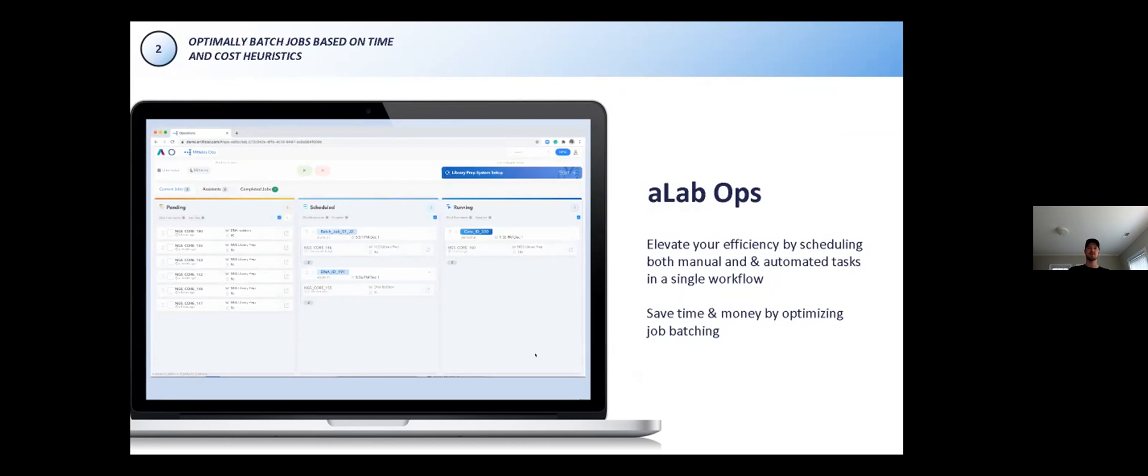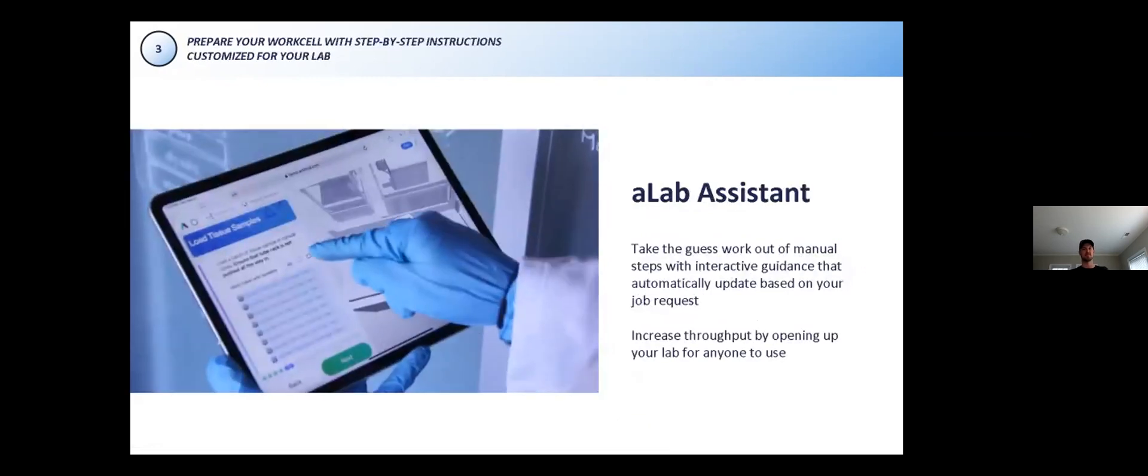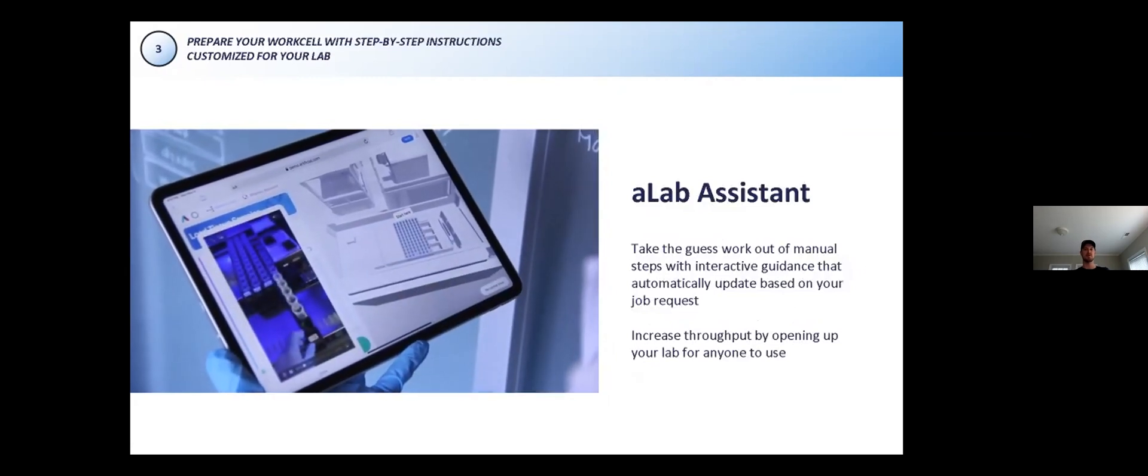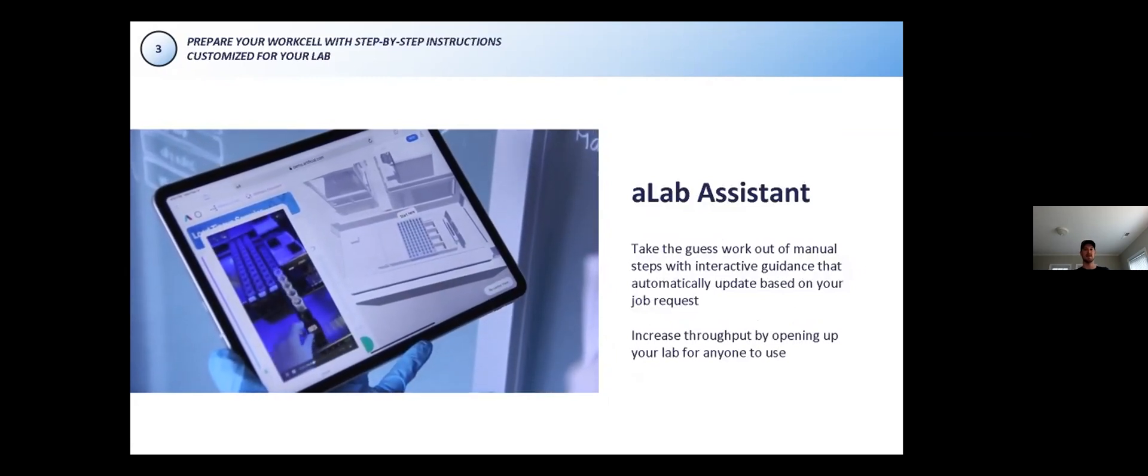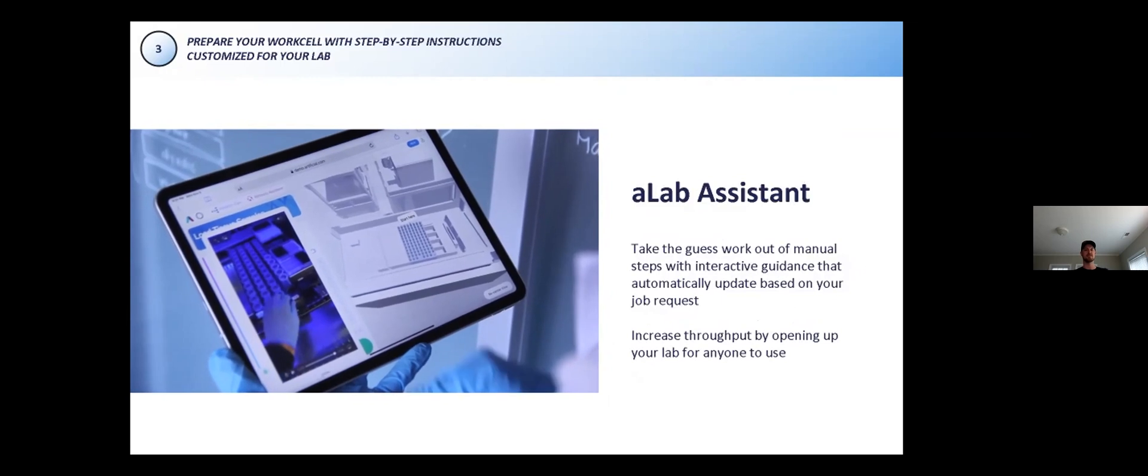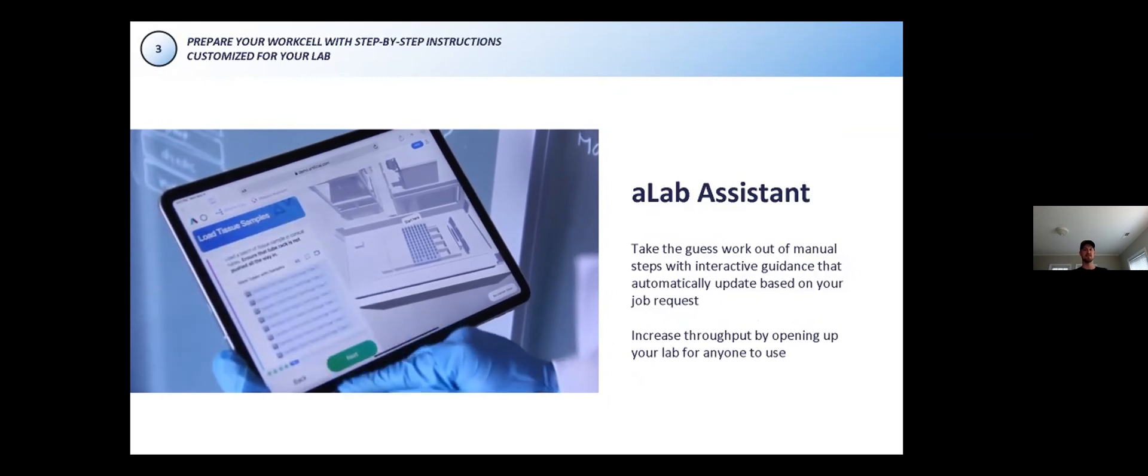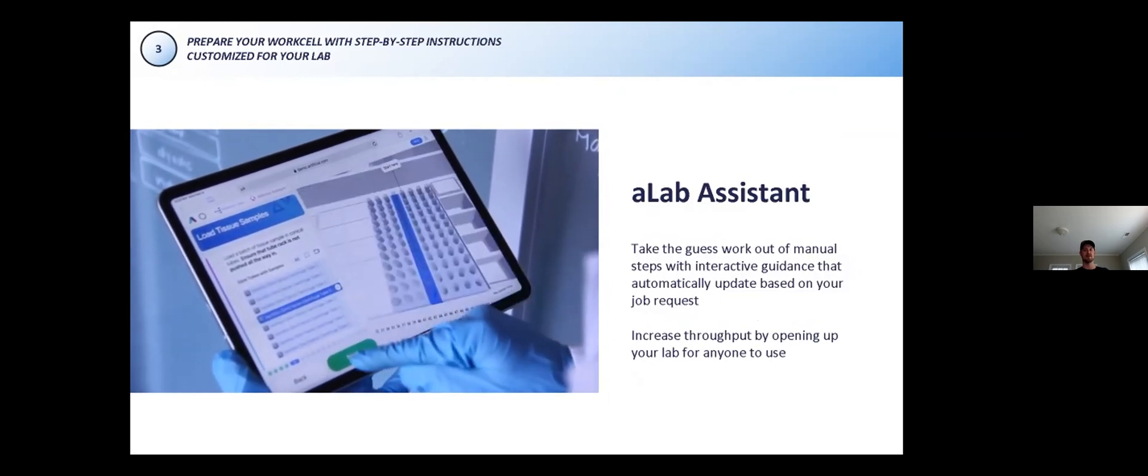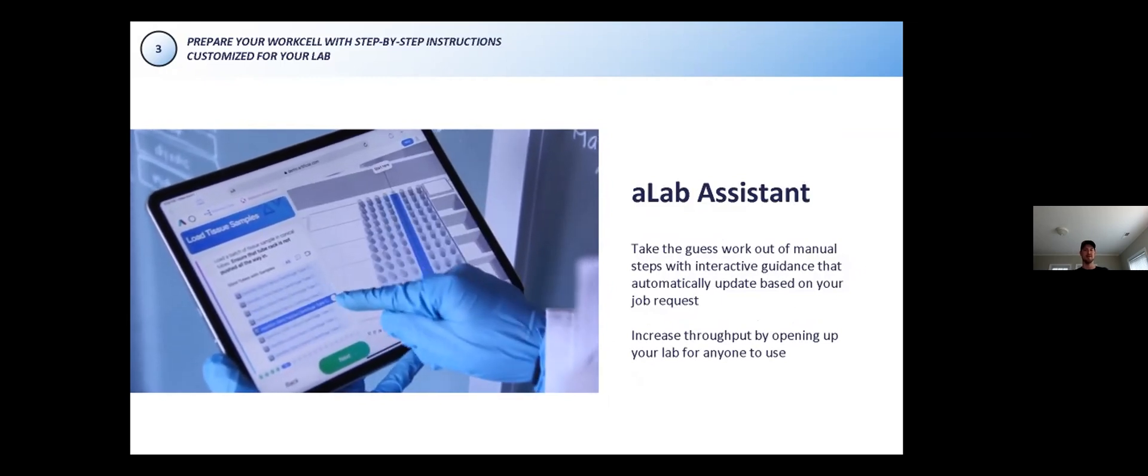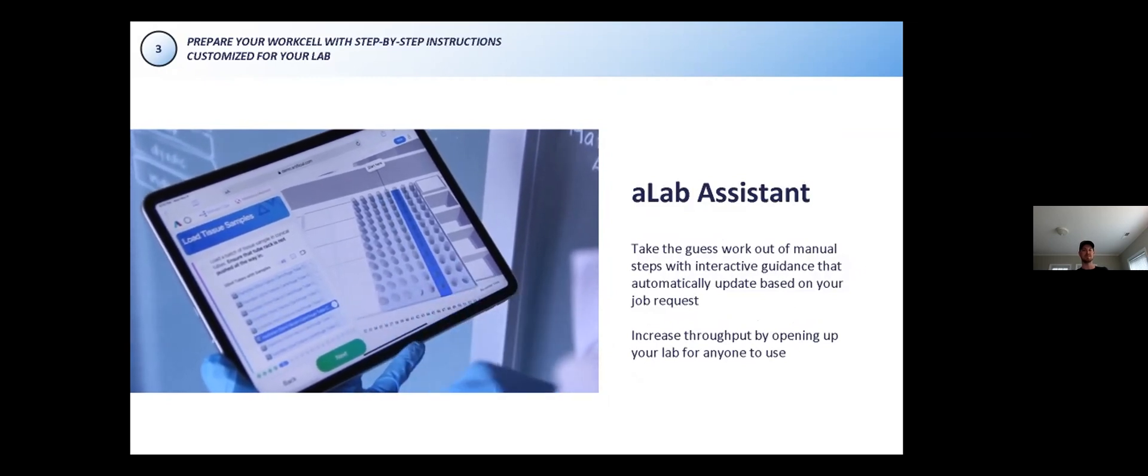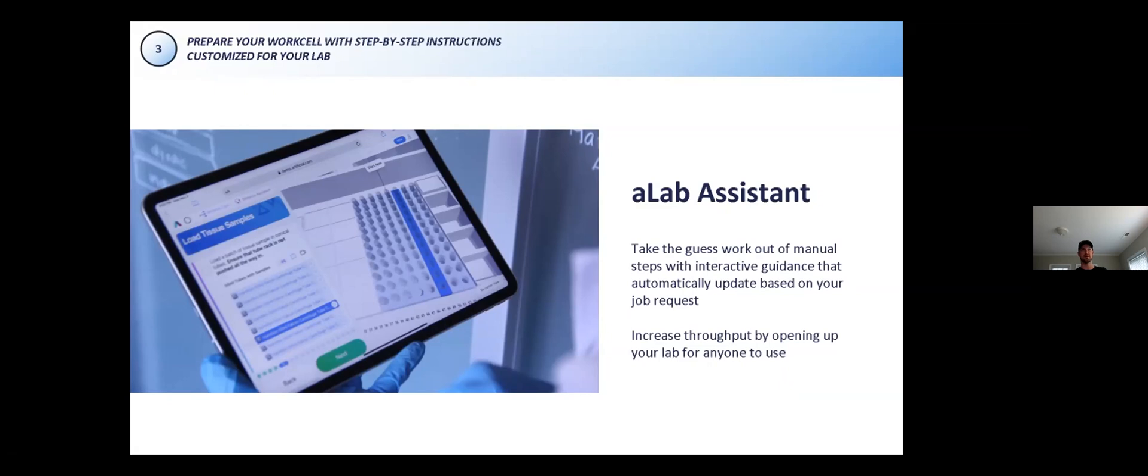The manual steps are completed by a user through what we call A-Lab assistance. The video here shows a user being guided on how to set up samples on a Hamilton Vantage deck with a digital checklist and a digital twin highlighting the relevant locations. Embedded media can also be shown here for use when more detail is required. In addition to these setup instructions, you can configure assistants to prompt users to record lot numbers of reagents, which will be reflected in the results of the process and increase the traceability of all reagents.